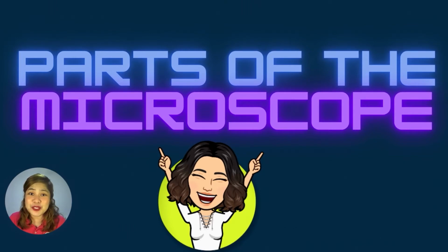For today, we will discuss the different parts of the microscope. Why do we need to know them? So that we will know how to use or manipulate the microscope. If we do not know the parts of the microscope, then eventually we cannot use it properly. So we need to learn first the different parts of the microscope.